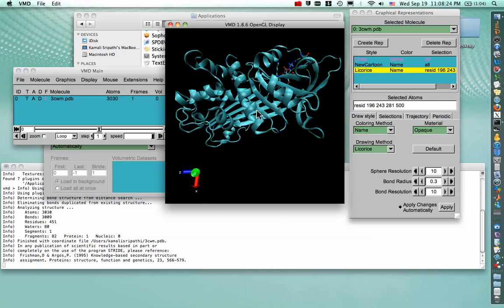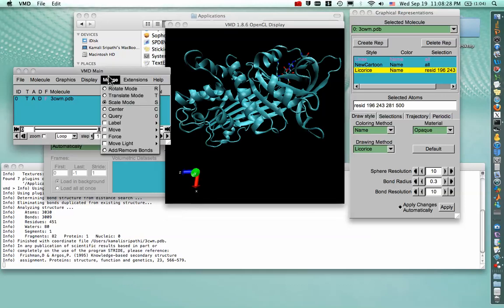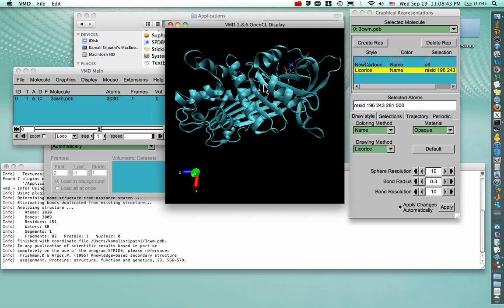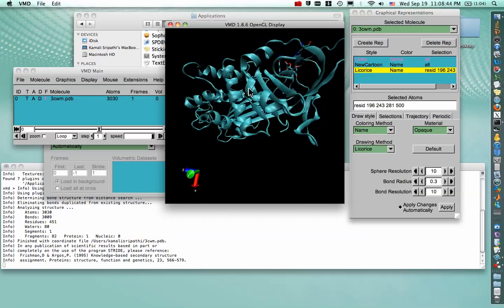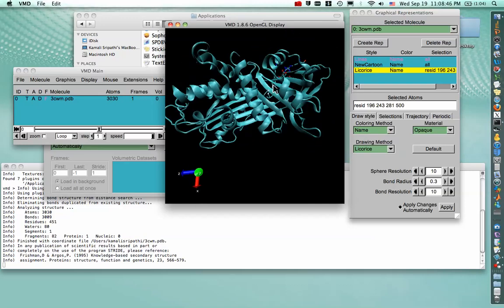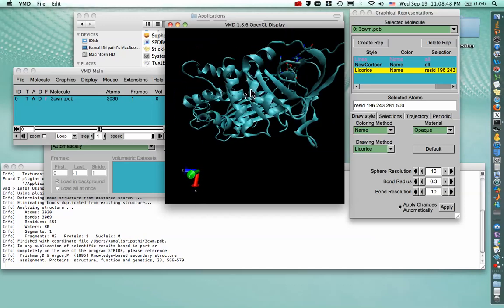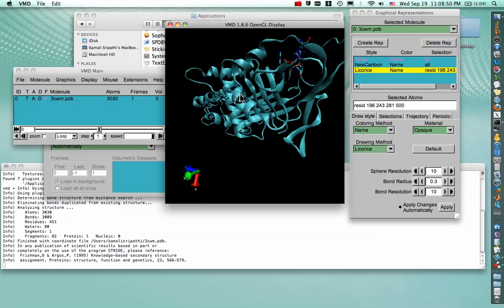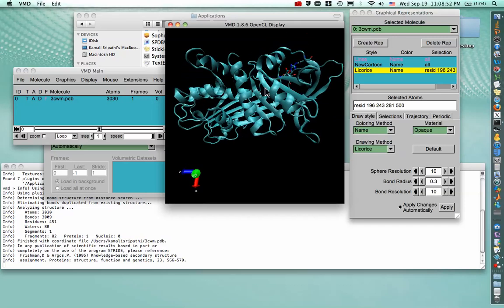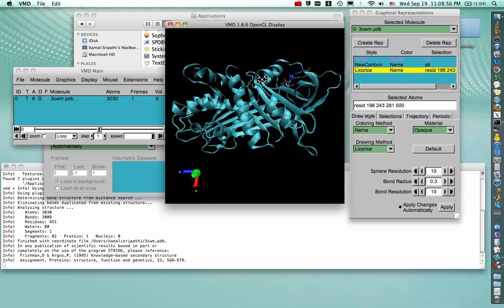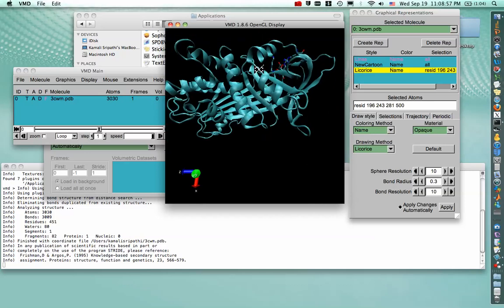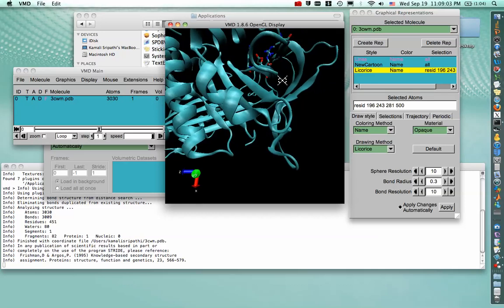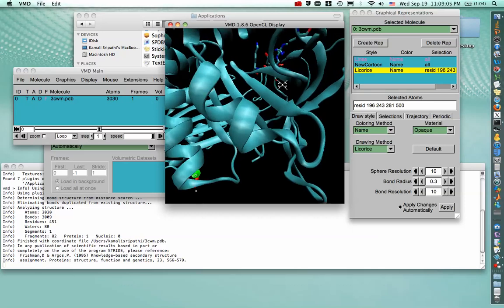And instead of going to the mouse submenu all the time, we can use the shortcuts that are specified. So if we want R, rotate or translate, we can just hover the mouse over the OpenGL window, make sure the GL window is active, and press R for rotating. And you know that your mode has changed because the mouse cursor changes shape slightly. So when you press T, you'll see it more. You know now that you can translate up or down or side to side. So we'll want to do a combination of that to zoom into our selection.